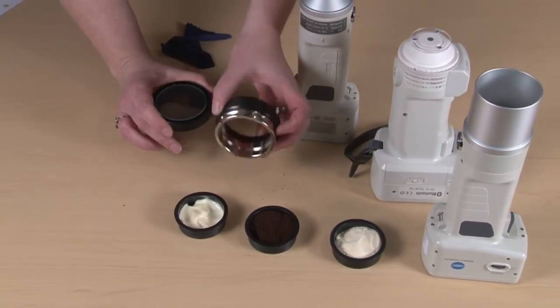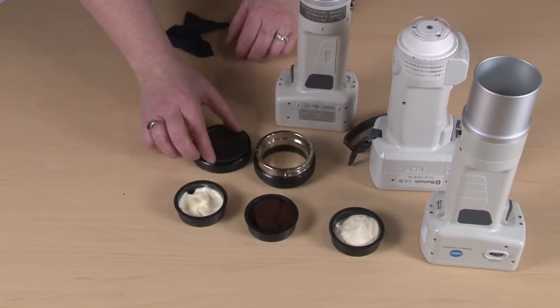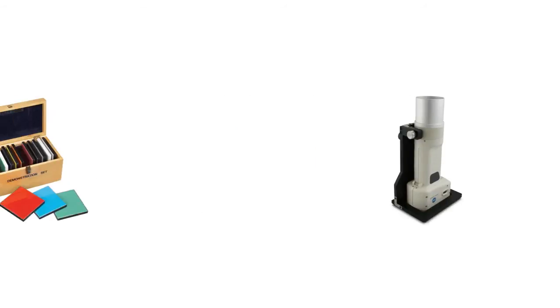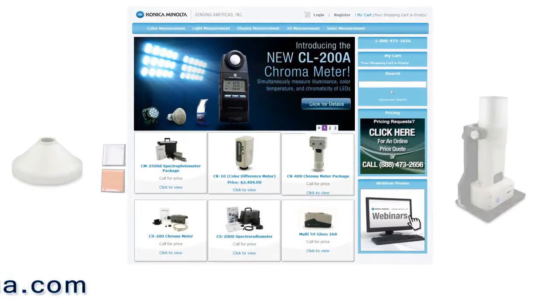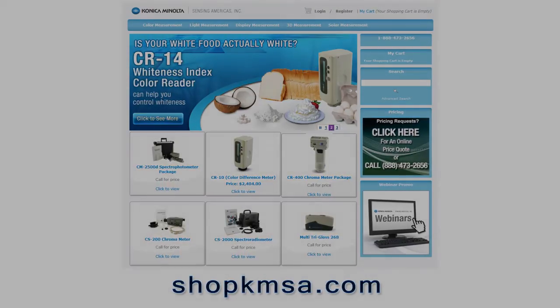There are also replacement parts for this glass and for the ring if it gets damaged over time. We recommend that you clean the glass with a mild detergent and do not use abrasive materials with it. For more information on Konica Minolta accessories for our color and appearance product line, please go to shopkmsa.com. Thank you.